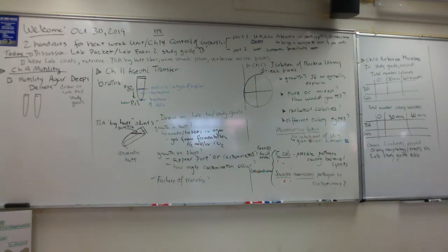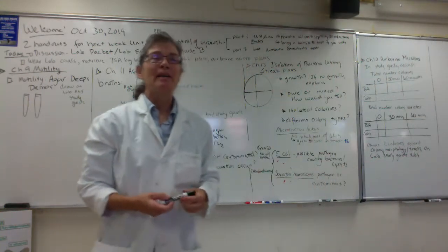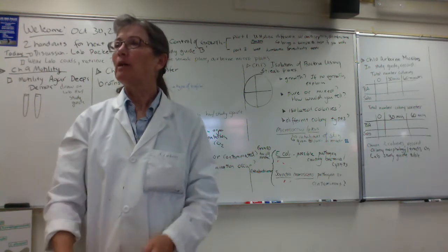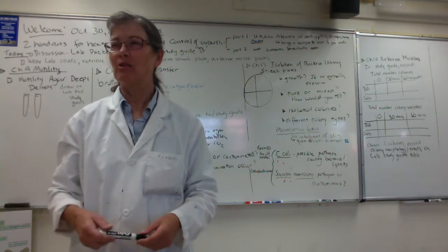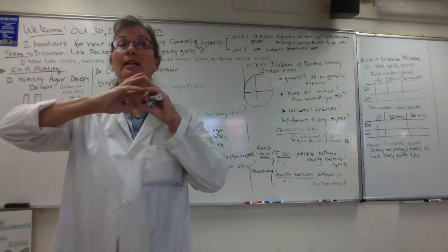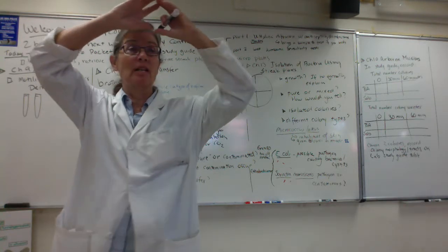Awesome. So you guys, if we were screening the urine to see what's the pathogen, Micrococcus luteus, I think that's just part of the skin, normal microbiome, maybe on the mucous membrane. So I wouldn't think that the Micrococcus is the pathogen, right? But some of you have a much bigger non-pigmented colony. Who has that one? Who has the big non-pigmented colonies?